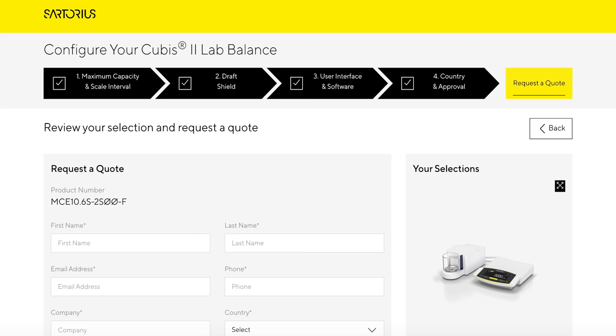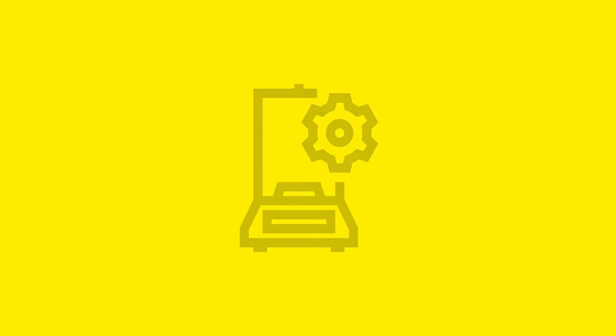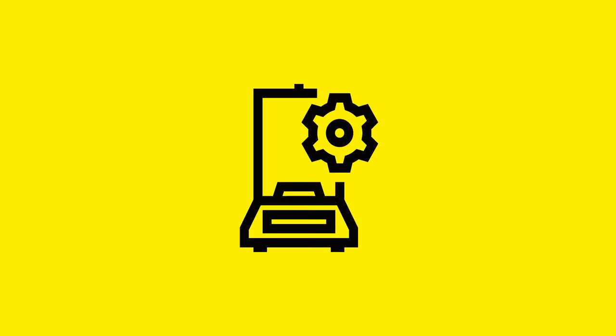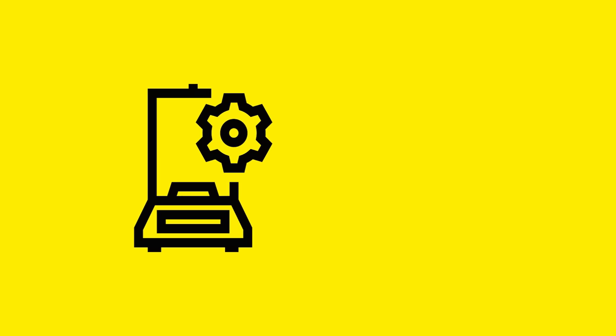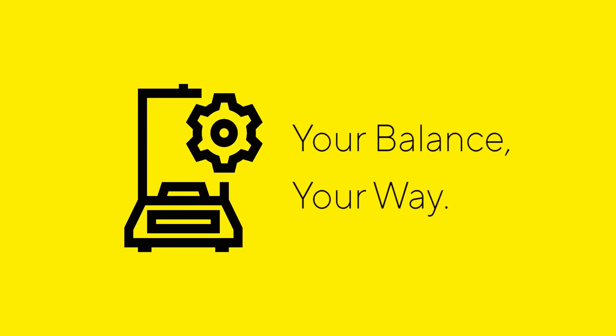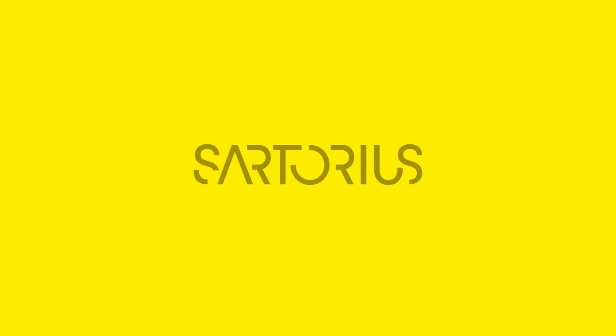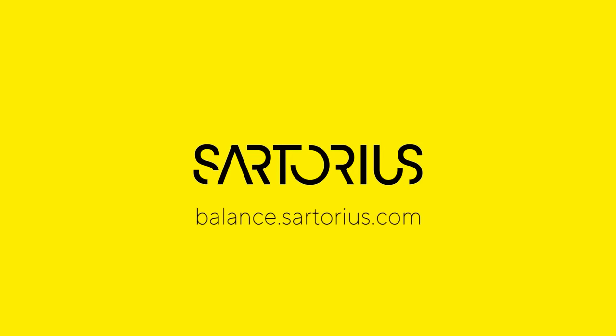To finish it off, submit your custom Qubis 2 Configuration for your emailed quote. Qubis 2 Configurator — truly making your balance, your way. See for yourself. Customize your balance today.